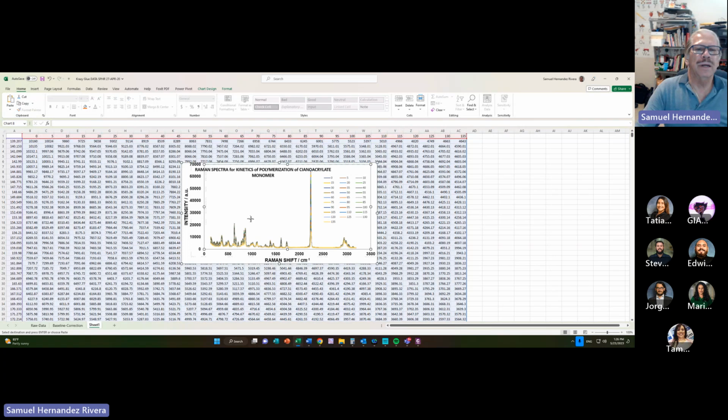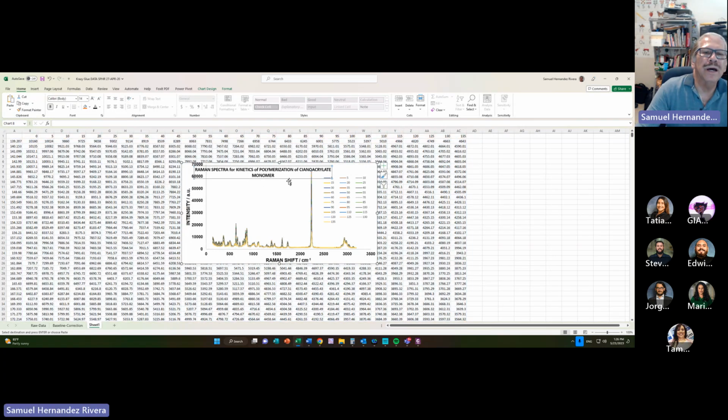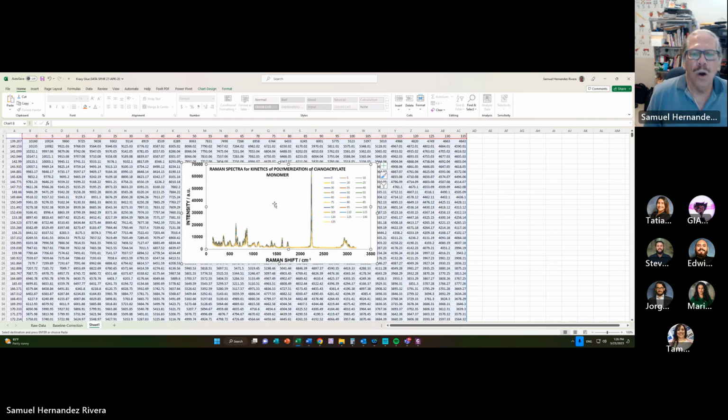Now we want to have the back part of the graph. We will have it also in the borders that they should look very dark also.